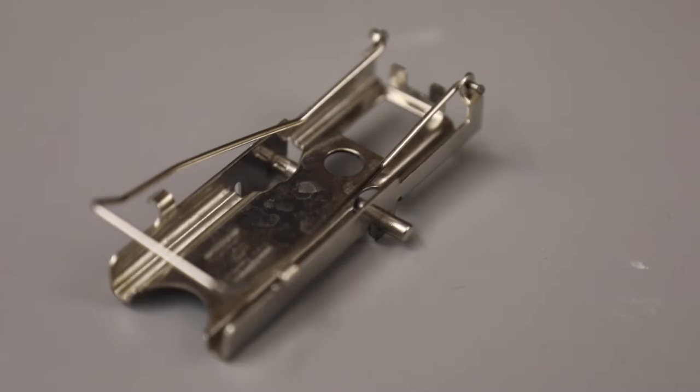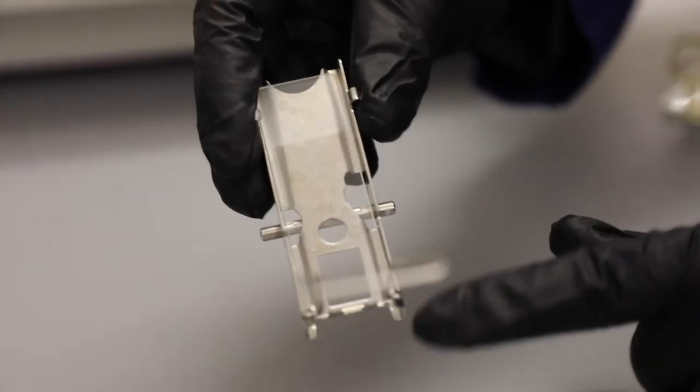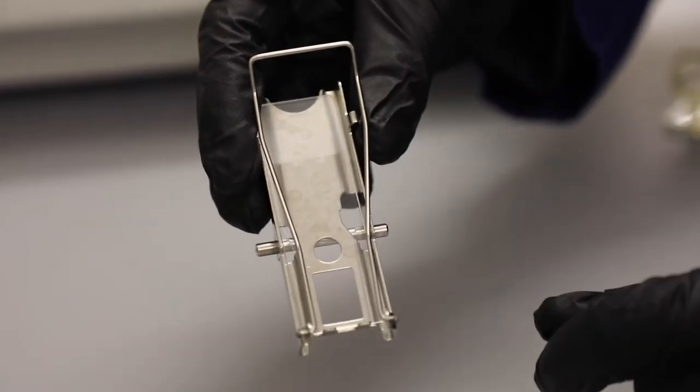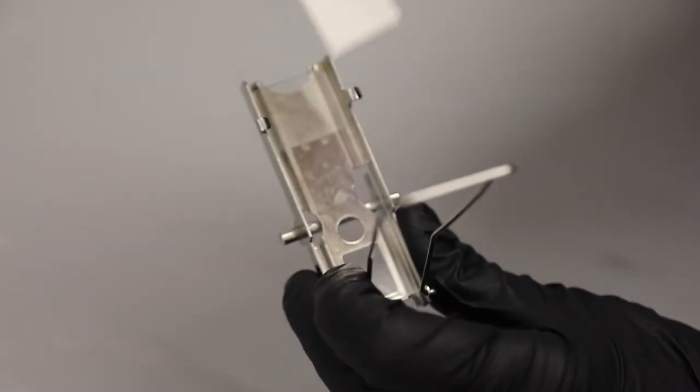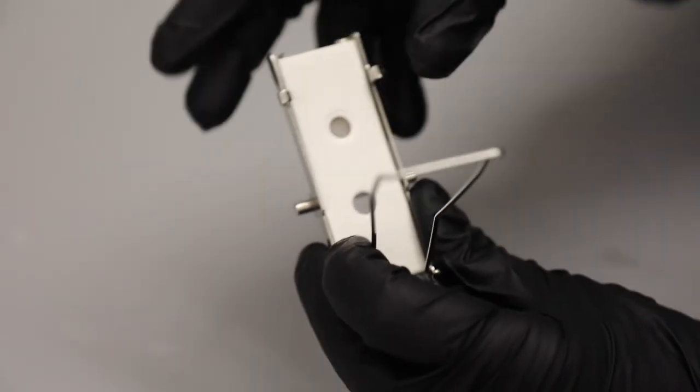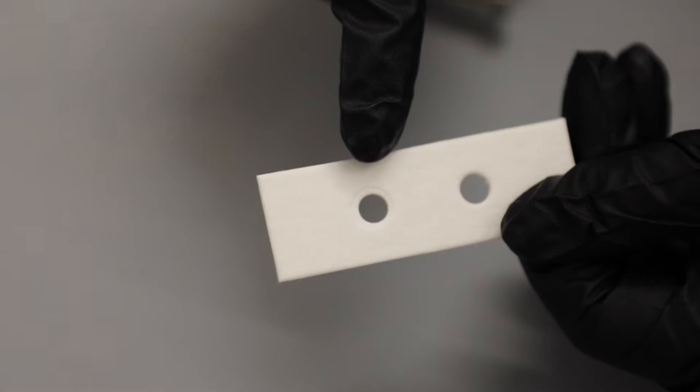Microscope slides must be specially prepared before being used in the Cytospin. First, put the slide in the metal cassette with the frosted end opposite the hinge. Put a filter on top of the slide with an unused hole over the corresponding hole in the cassette. Used holes will have an indent around the side.